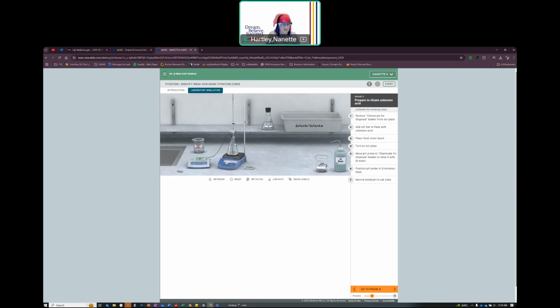These things are really expensive, so I would never allow it to, one, touch that stir bar at the bottom. It'll damage it. And two, I would never just leave it hanging like that. You always hold it. So just now that I've said that, and we want to record the initial pH, which is 2.87.